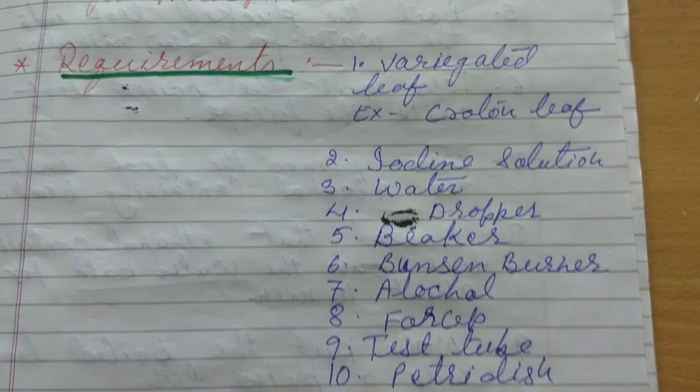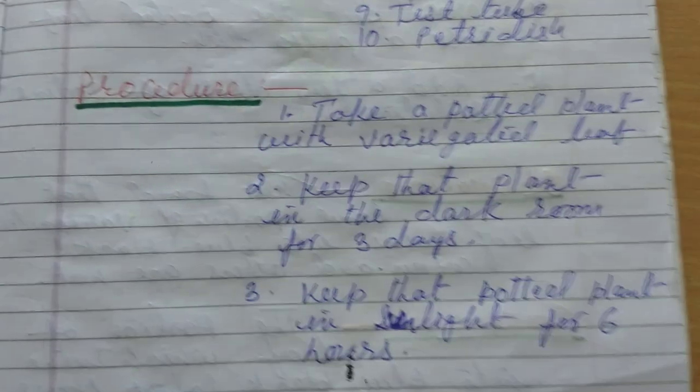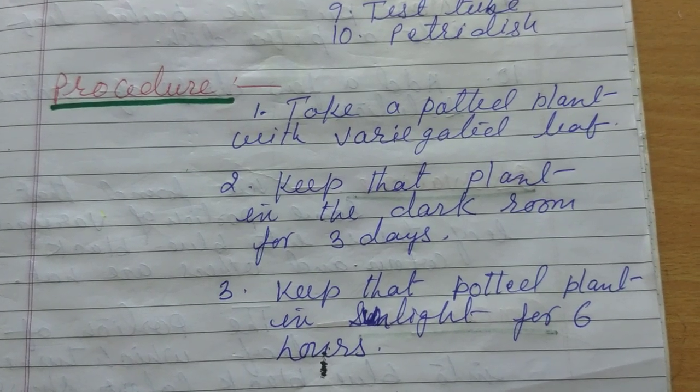Now let's move to the procedure. What will be the procedure? The first step is to take a potted plant with a variegated leaf.